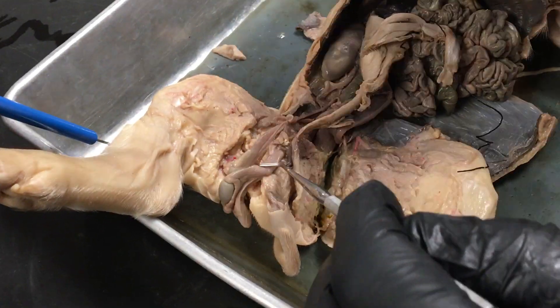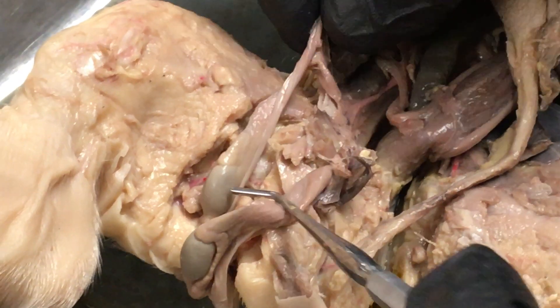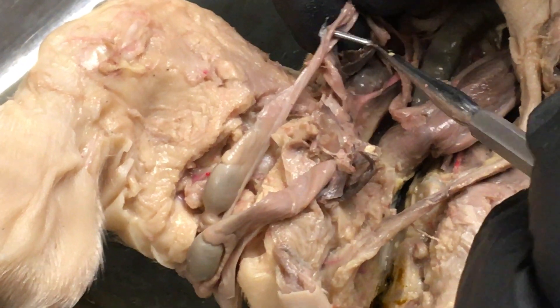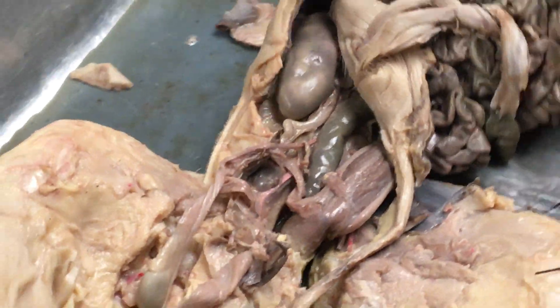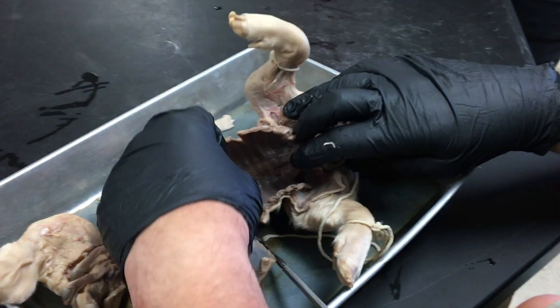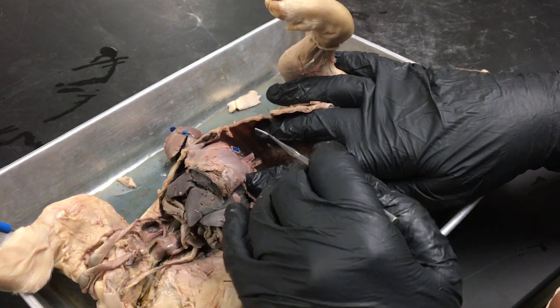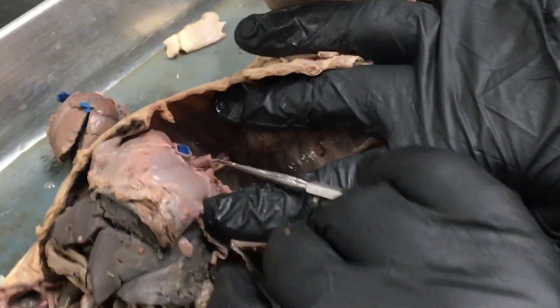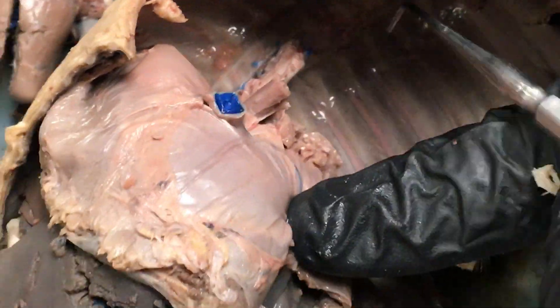The vas deferens — just again in case you missed it — leads from here as this flat ribbon right there. I've been told that I missed the esophagus on the digestive tract — here's the esophagus right there, and it leads to the stomach. Of course lots of stuff has been removed here.